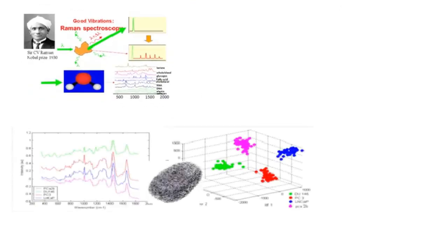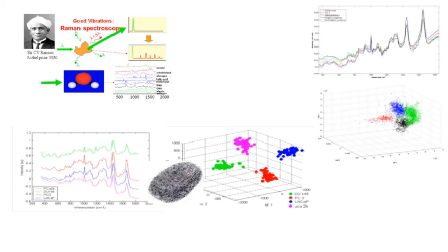That allows us to effectively develop a fingerprint by looking at the laser line, which would be at 0, and we're looking at the shift as we move across to the right along the bottom axis. We get a fingerprint of the different materials that we're measuring. And this is an example of 4 prostate cancer cell lines, and we're able to separate those out by their individual biochemical components. Here's an example of tissues collected from lymph nodes, and I will talk about those later, but you can see their fingerprints and they separate as well differently.